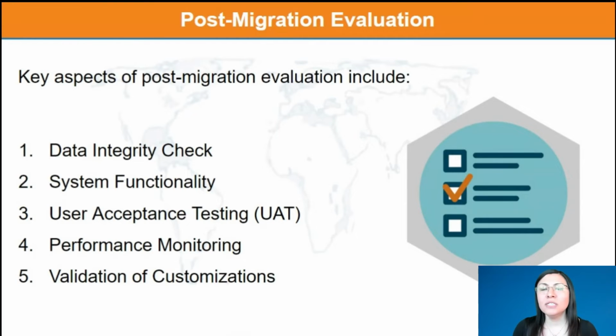So if there were some configurations or modifications in the new LIMS, we need to make sure that they function properly and that they are not impacting the everyday operation of your lab.